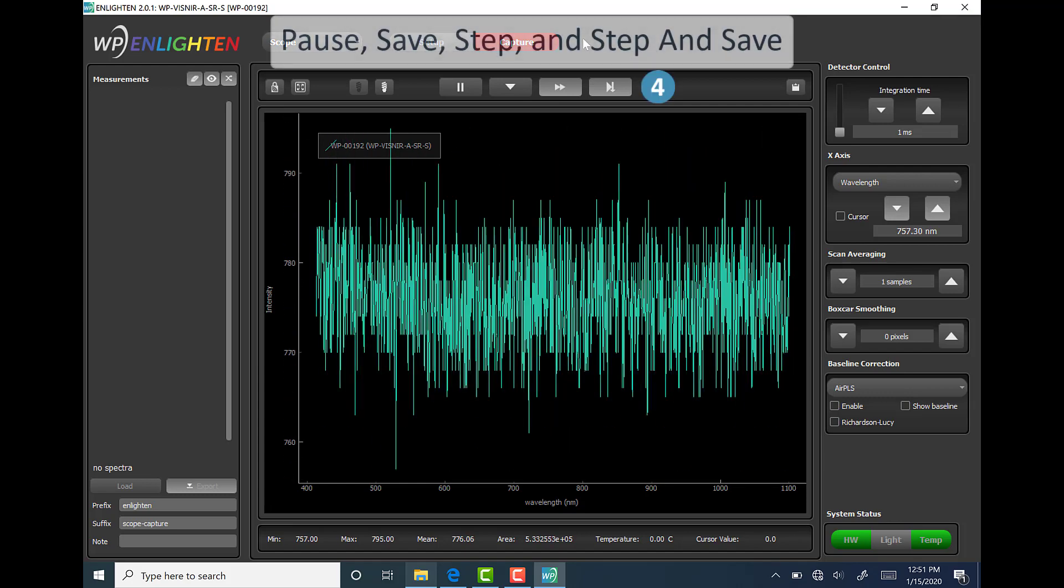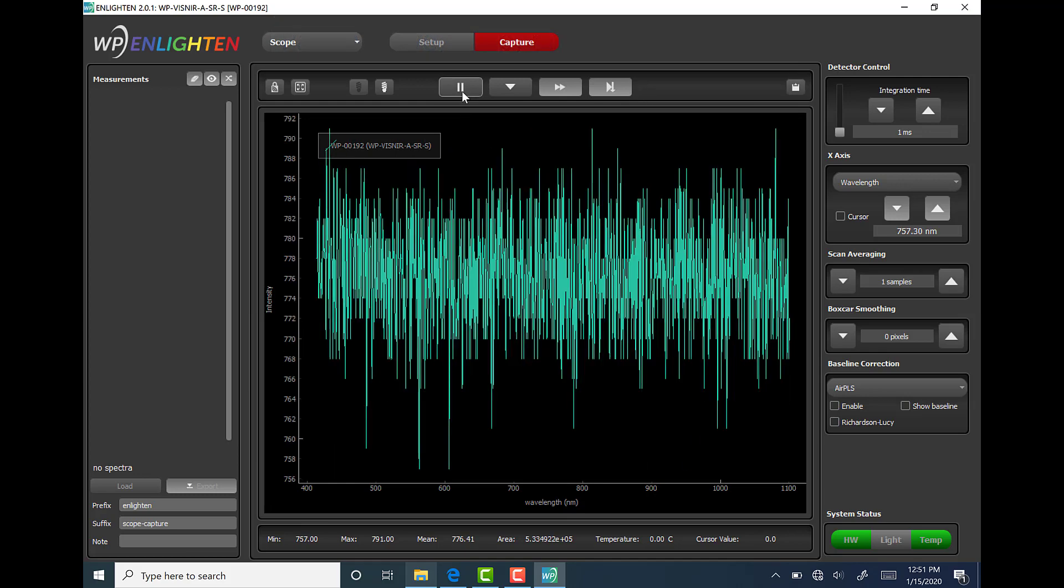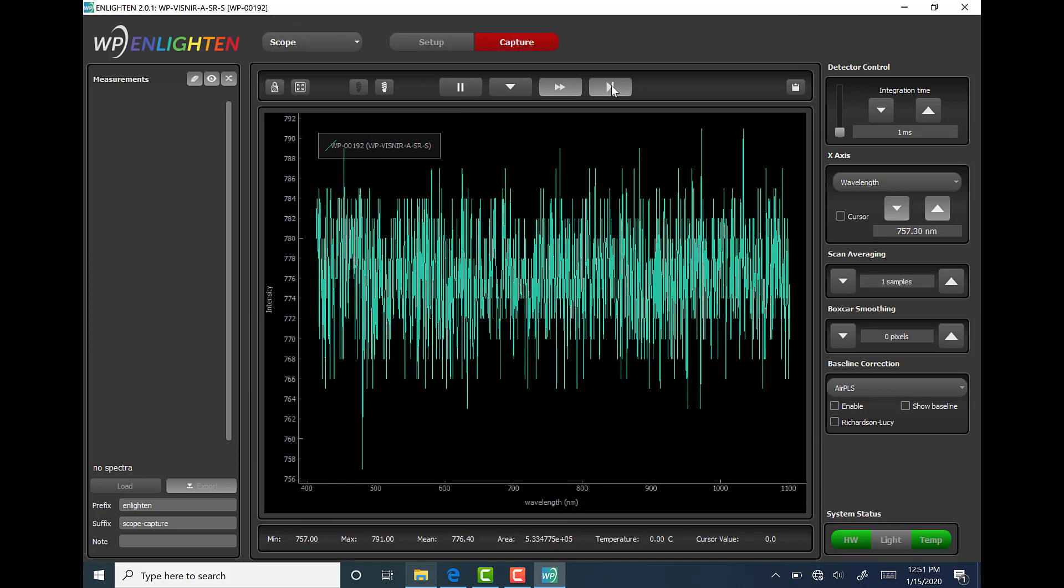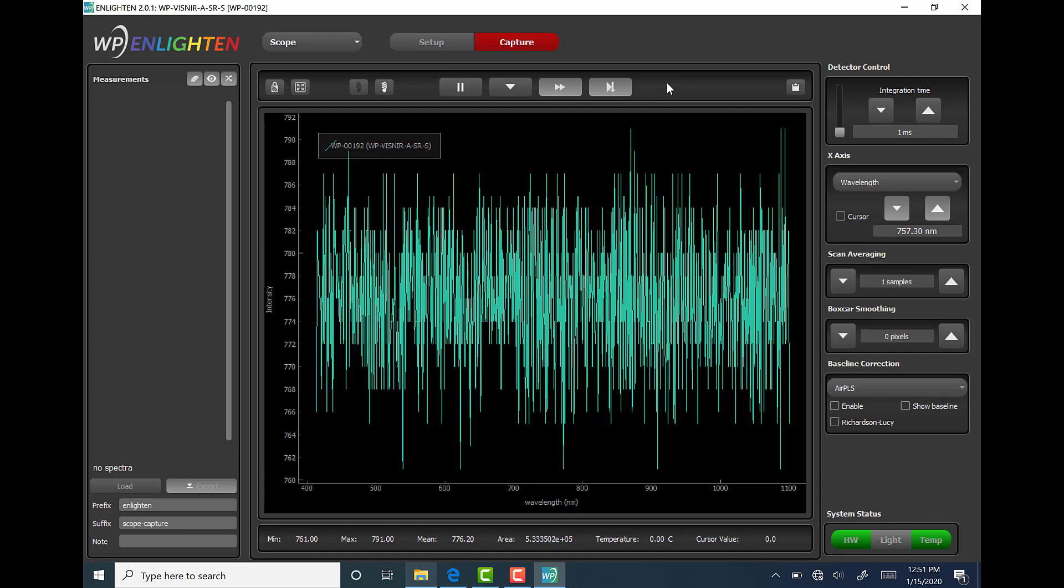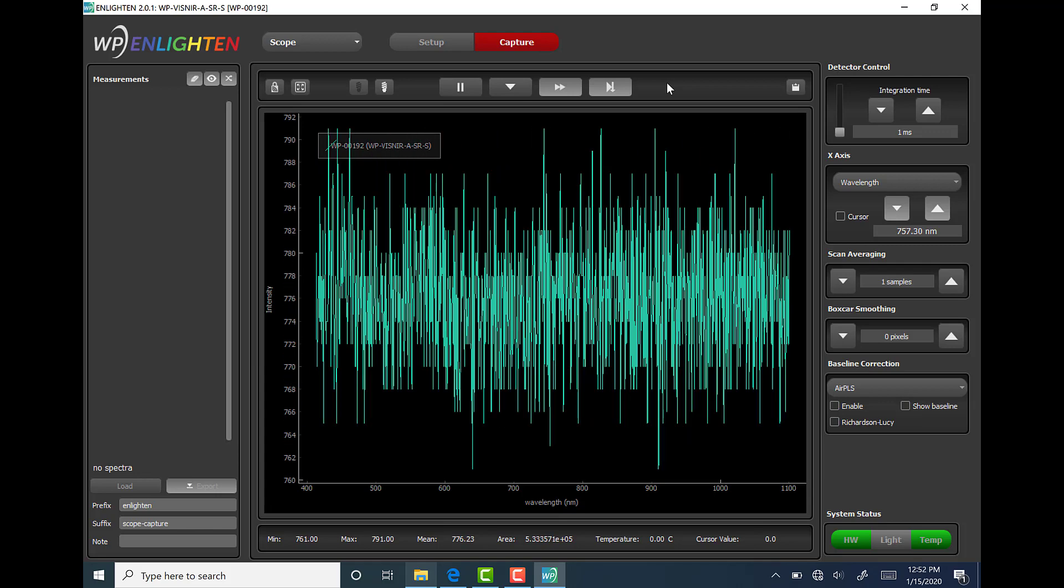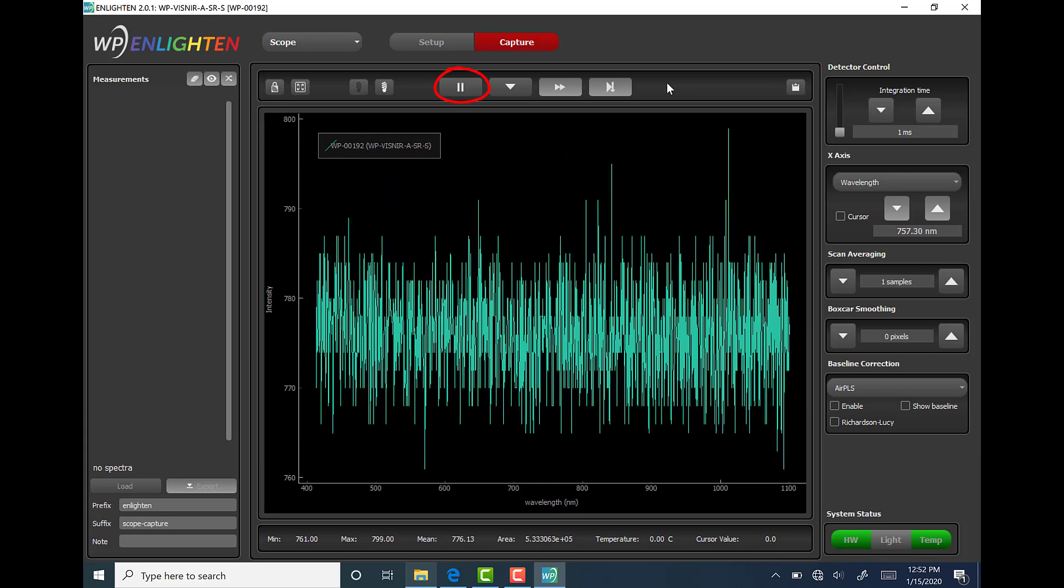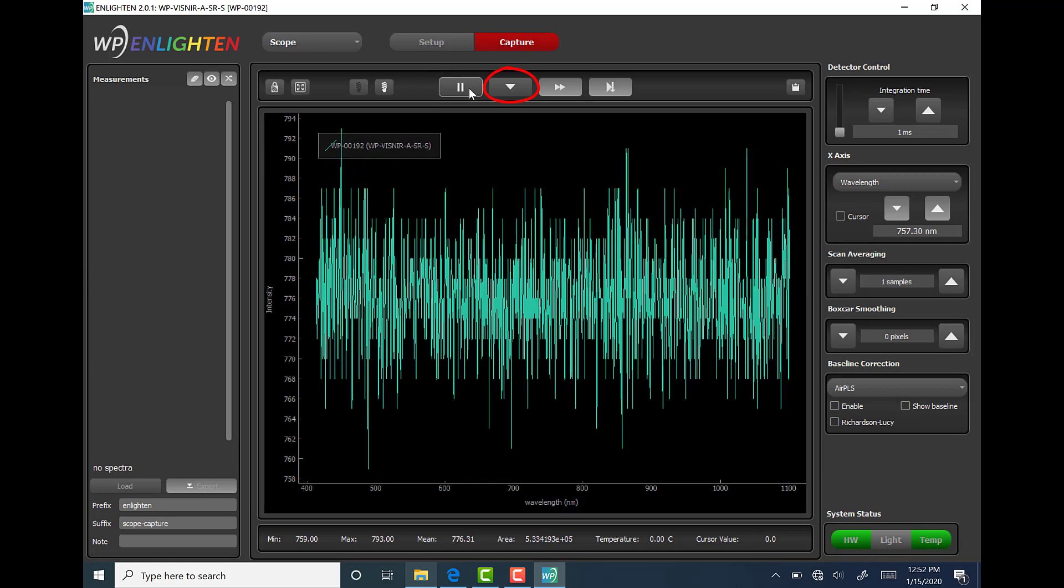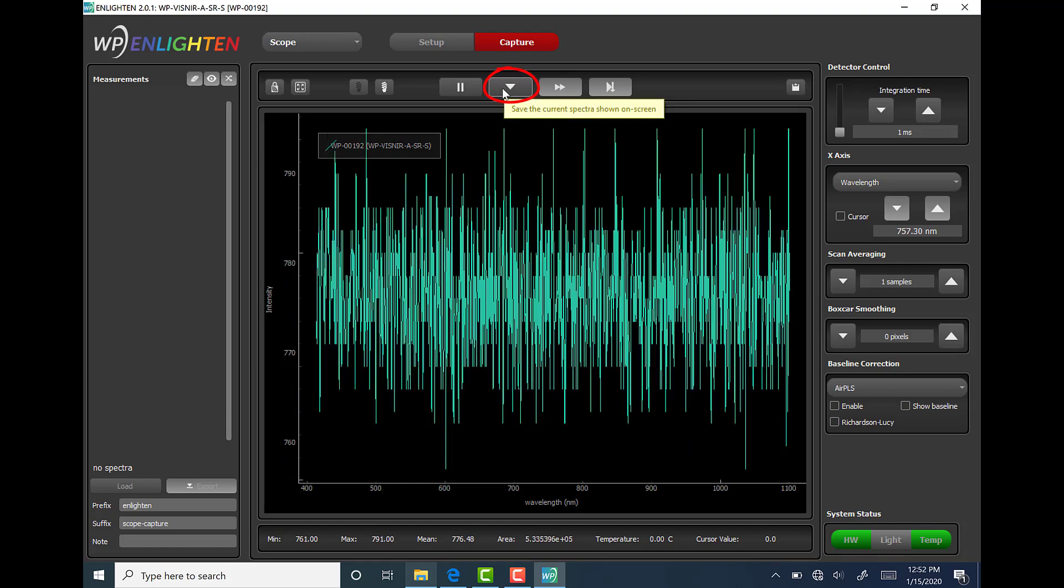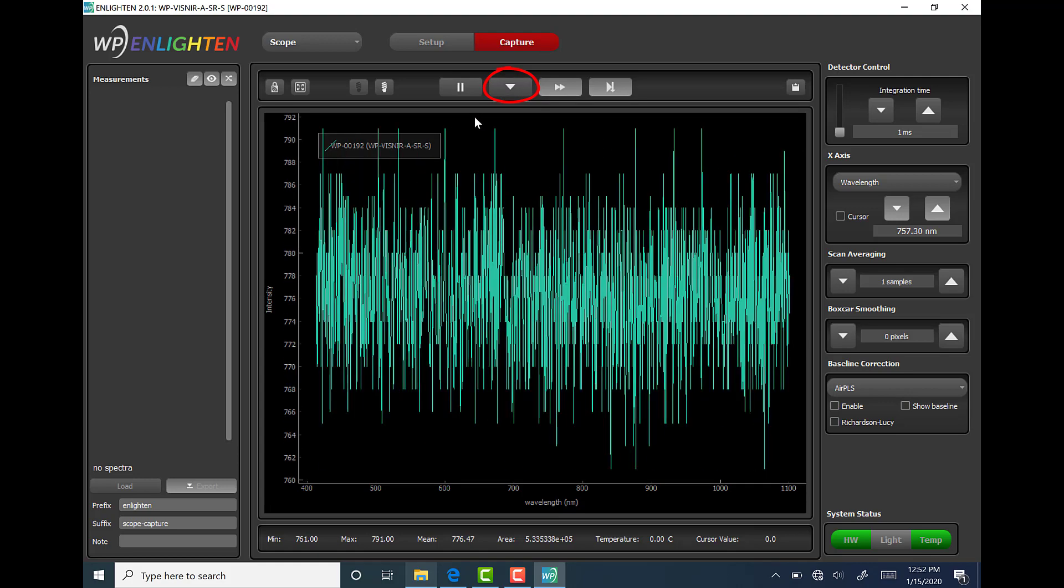Next we have a set of four VCR type buttons directly above the spectrum chart. The pause, save, step, and step and save buttons serve in a variety of ways. Upon launching the Enlighten software, the teal colored reading in the spectrum chart is continuous or free running, which means it jumps around a lot. So the user can use the pause button to literally pause the reading to look at it more closely. You can see that once the pause button is used, it changes to continuous acquisition with the triangle pointing to the right.